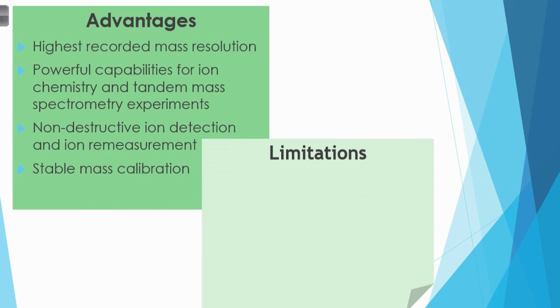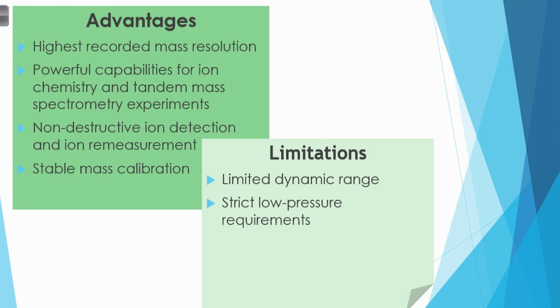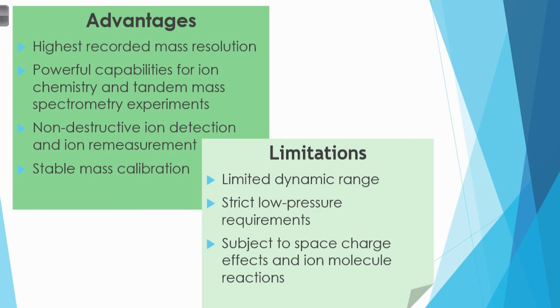Of course, ICR has some limitations. It has limited dynamic range. Its strict low pressure requirements mandate an external source for most analytical applications. It is also subject to space charge effects and ion molecule reactions.